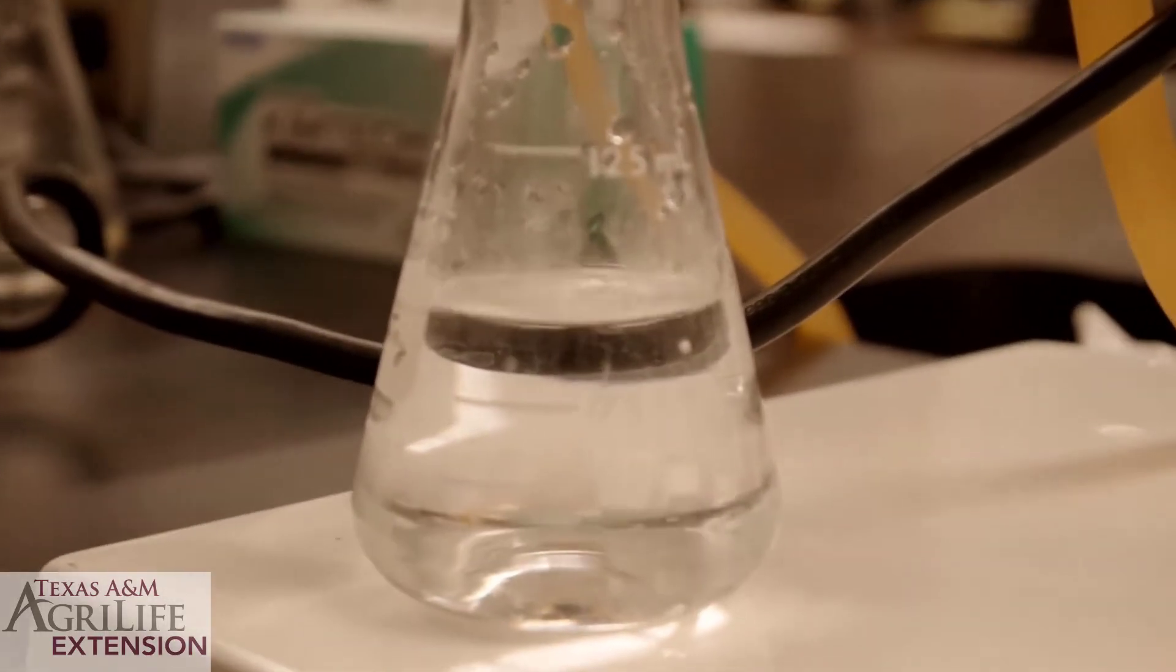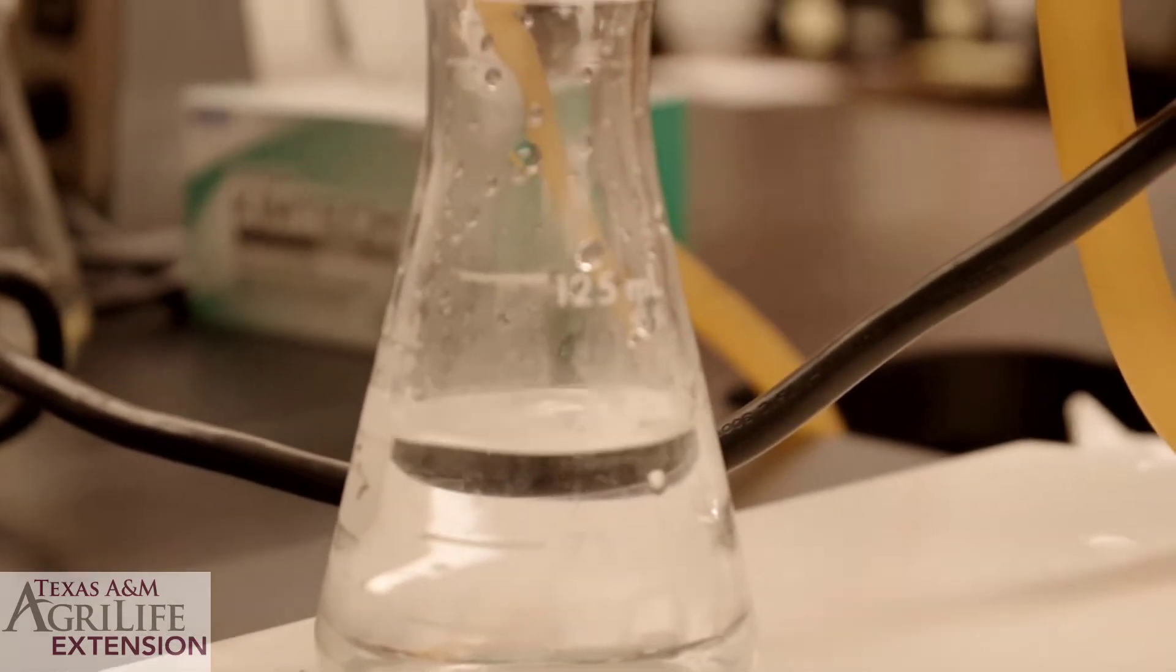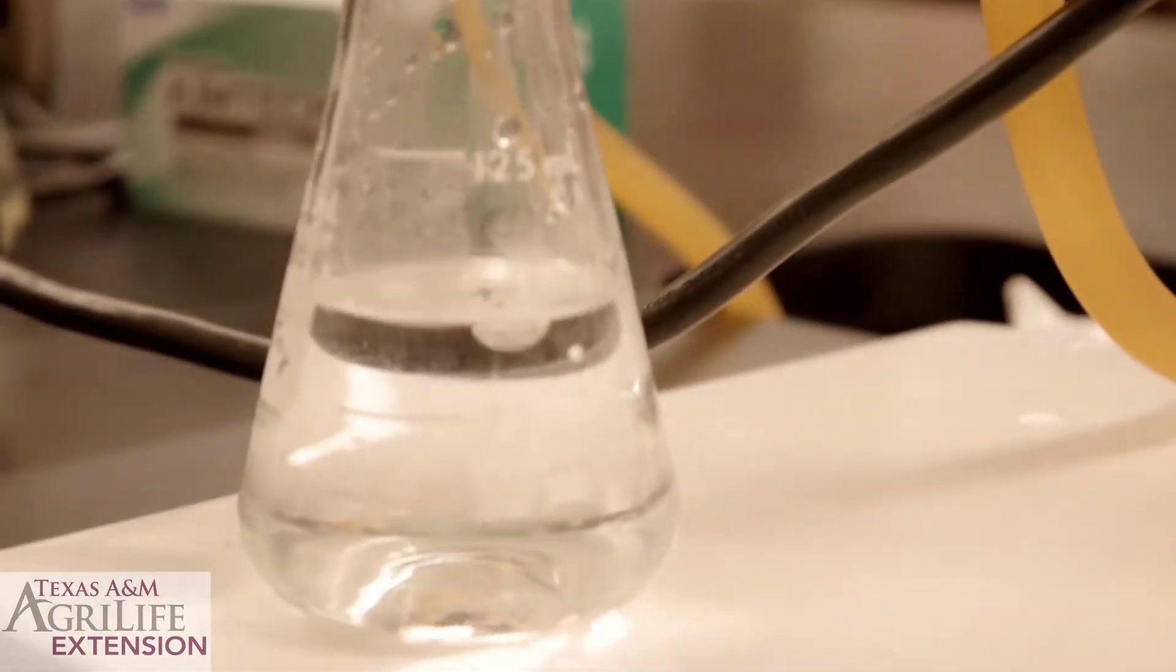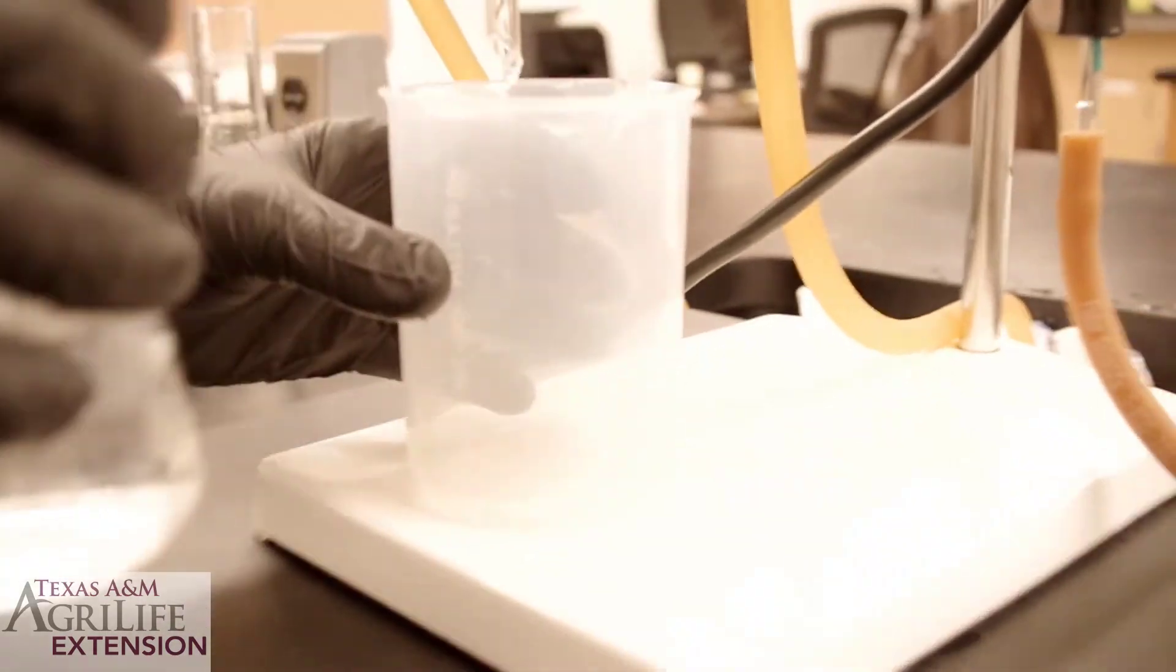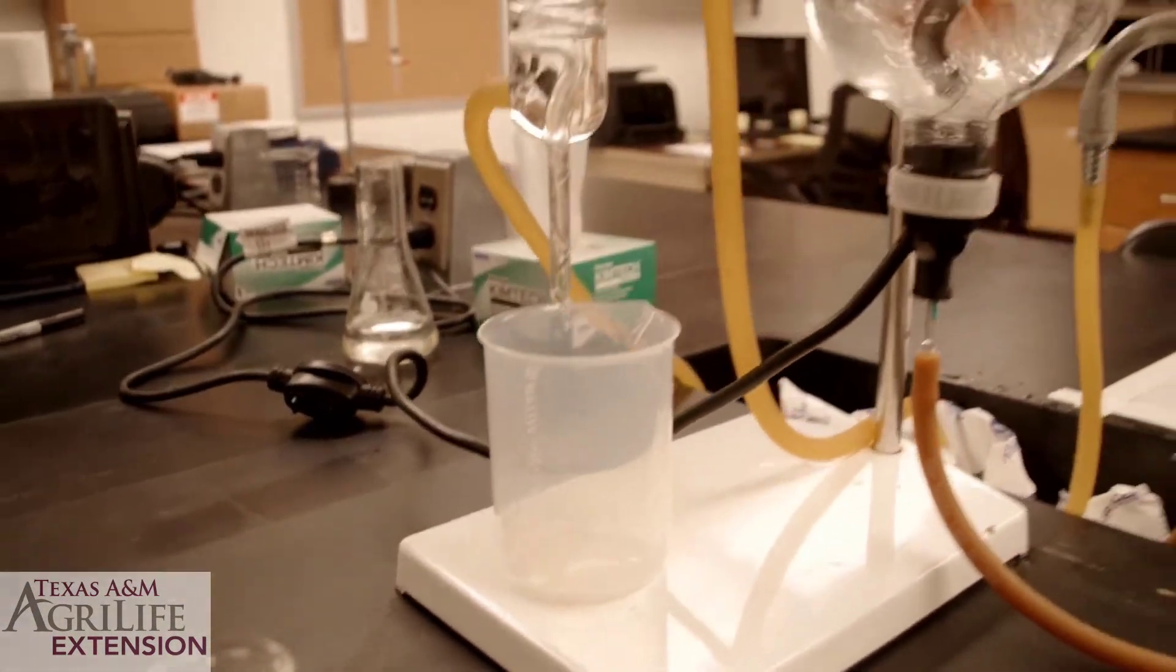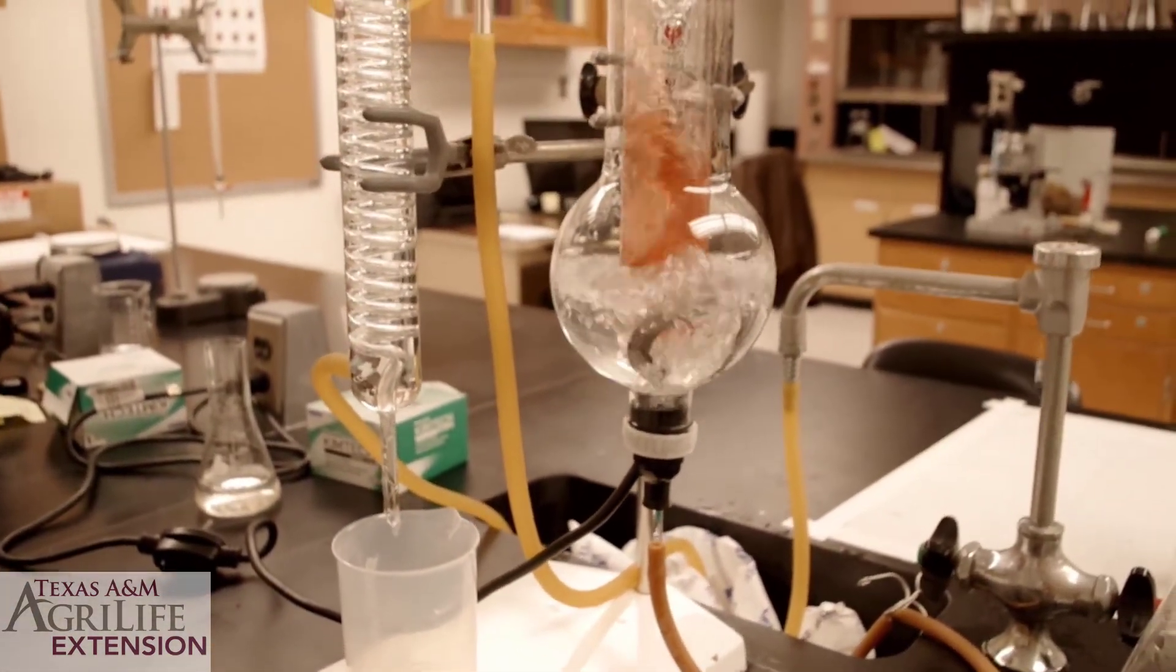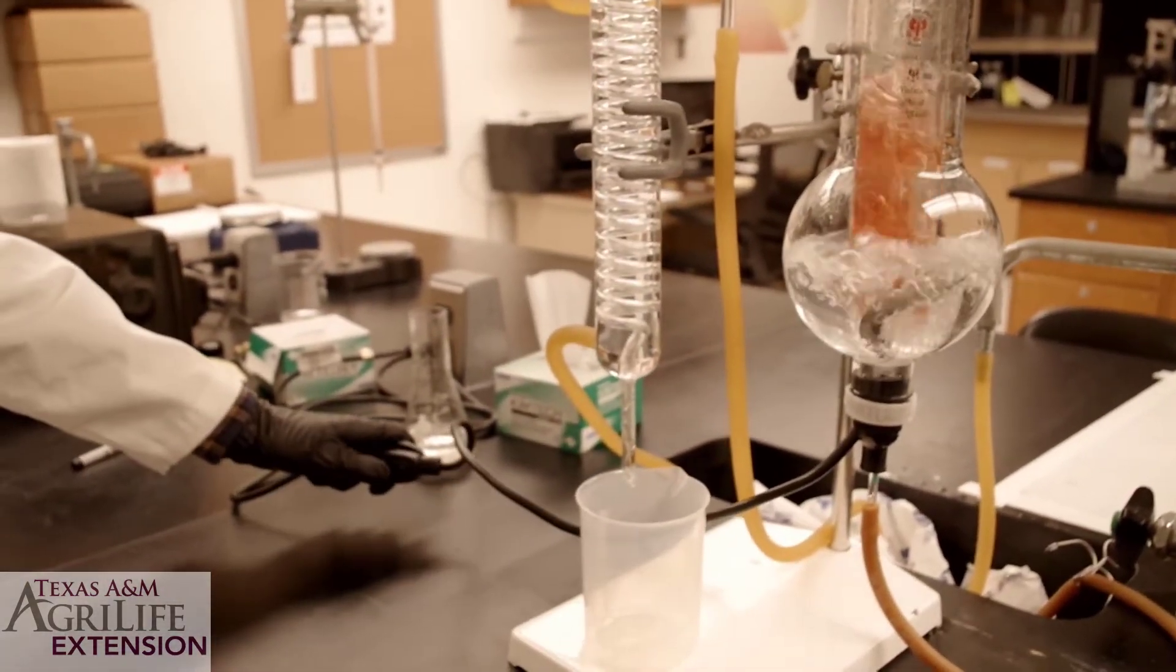Collect 100 milliliters of your distillate. Replace your collecting flask with a waste container. Then turn off your machine.